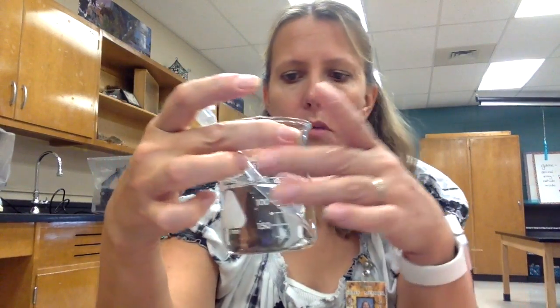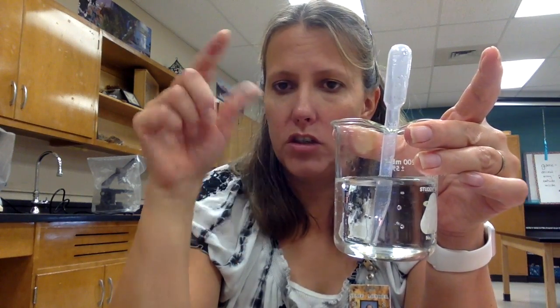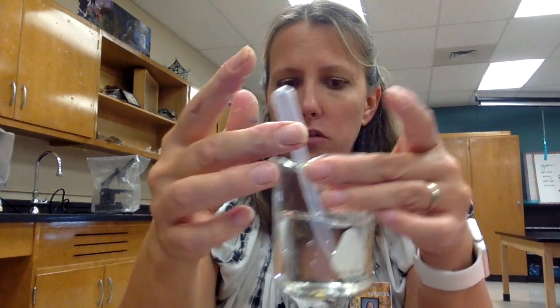Okay, and the trick here is to get a sample. So this is nice clean water out of the tap. But when it's pond water, you'll notice some schmutz on the bottom, some dirt or mud or plant material, and a lot of times the animals and cells are floating up at the top where there's a lot of oxygen. So those are two good places to get your sample from.